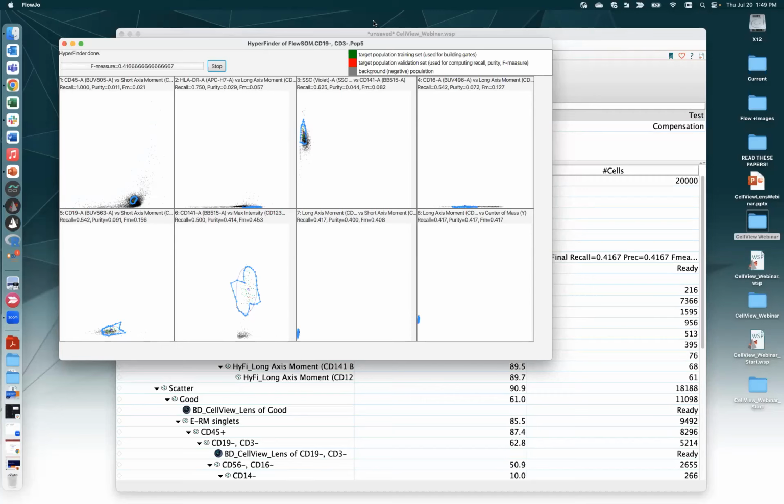Yeah, sure. Daniel, I will say it's probably not the optimal use of a super awesome high dimensional machine, but any experiment I think can be improved based on using the ability to visually just QC the data at the very least.